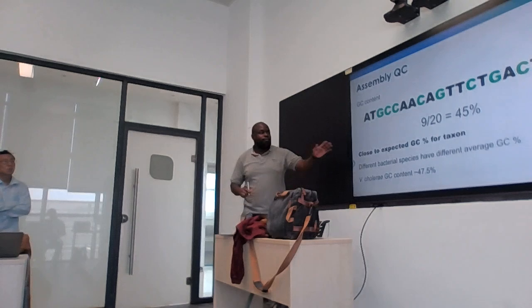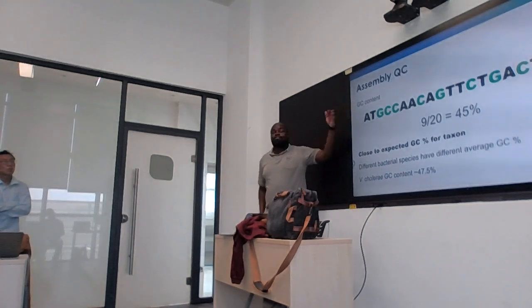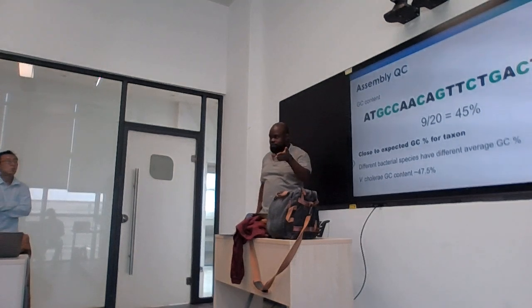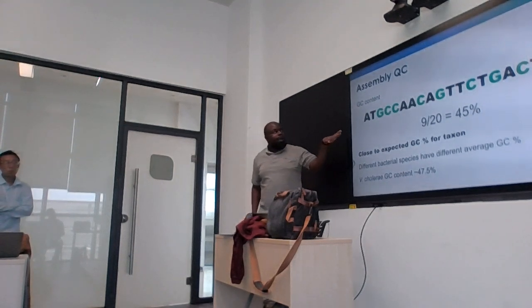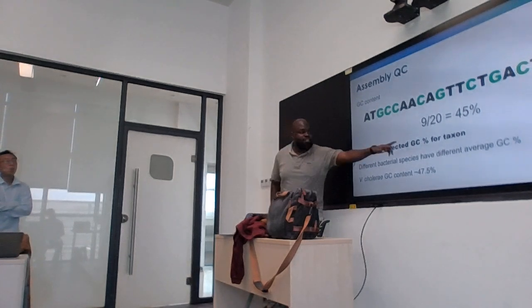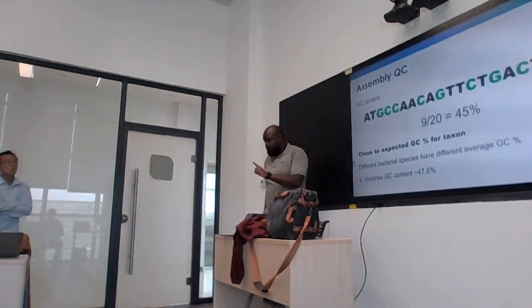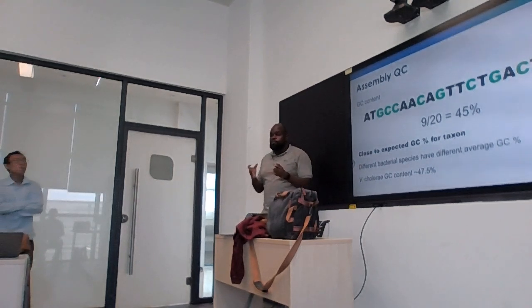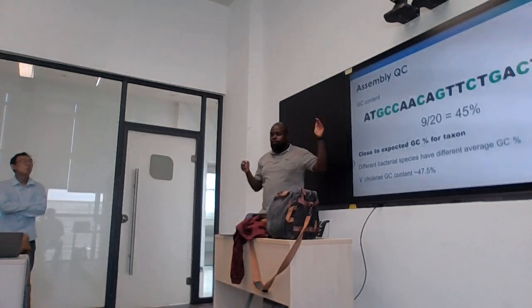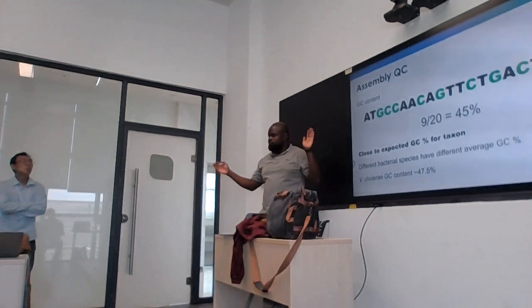All right. So one last thing is the GC content. You know, in DNA we have A, T, G, C, right? So again, for your GC content, you expect this to be as close as possible to your taxon or the pathogen that you're working with, right? We do know that some organisms are AT rich, which means they have more AT than GC. Okay? Some organisms have fewer AT, right? Again, you remember there are purines and pyrimidines, right? That's why we look by AT and GC.